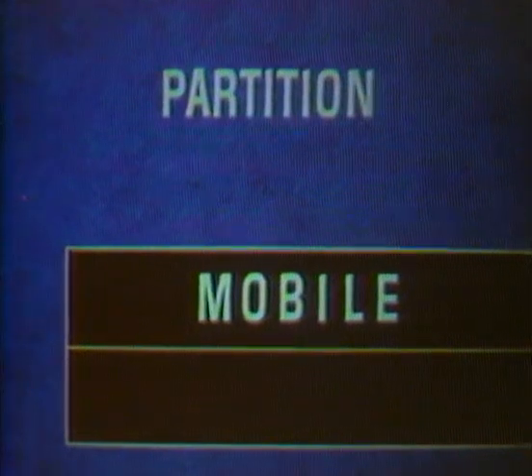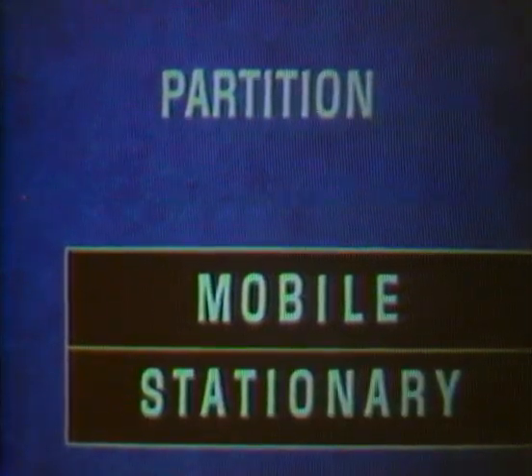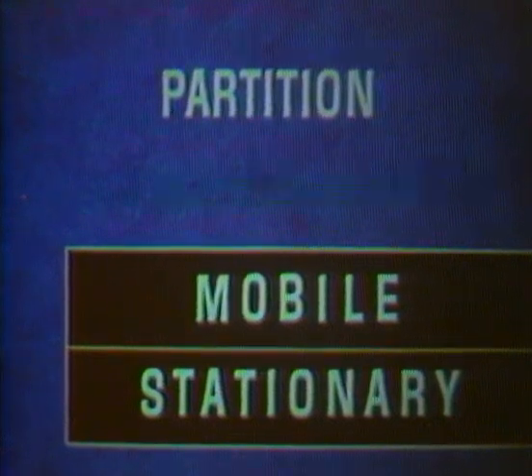For simplification, we'll show the column in this way, with the mobile phase as the upper layer and the stationary phase, a liquid in this case, as the lower one. We'll divide the column into a series of identical segments and assume that within each segment an equilibrium distribution is achieved during the passage of the moving phase. Each segment is called a theoretical plate.